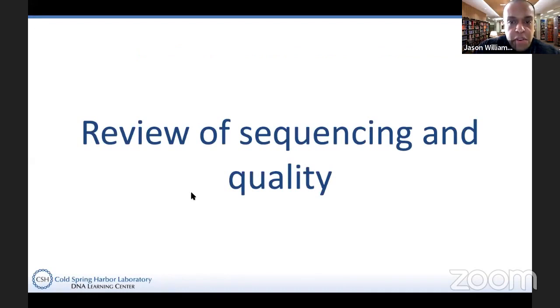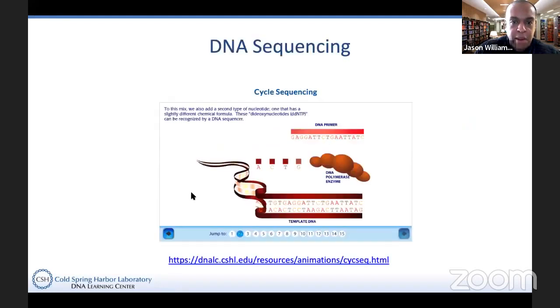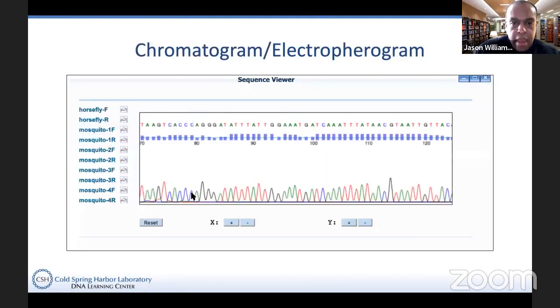Okay, so we're going to review sequencing and quality. I just want to say a moment about that. I don't want to spend a lot of time there because we spent time there last time, but we did cover what a DNA sequencing experiment is like, or where it comes from. Please go back and watch the other video and or search the DNA Learning Center website on cycle sequencing, because there was a detailed explanation along with some animations that explain how DNA sequencing works. So you want to have that information so that you can actually understand where our data came from. The other thing that we generated from that data, and which we're going to go back to in DNA Subway in a bit, is the chromatogram, or electropherogram.